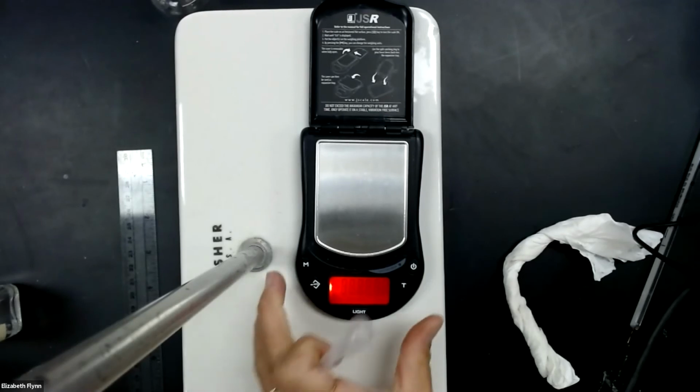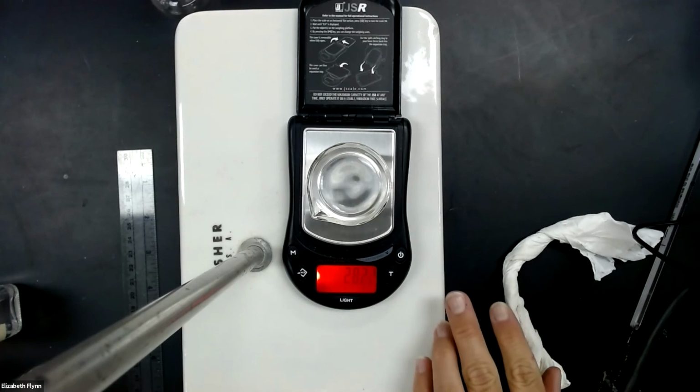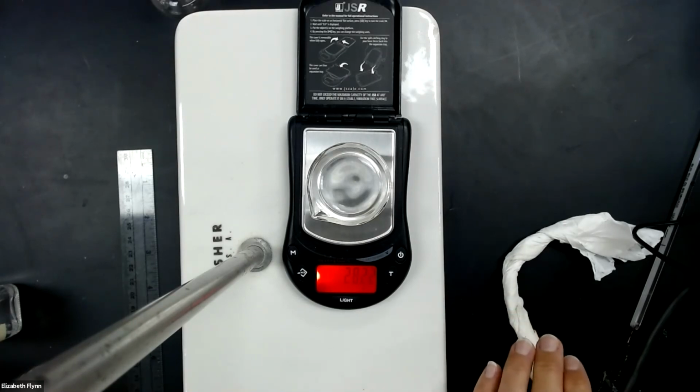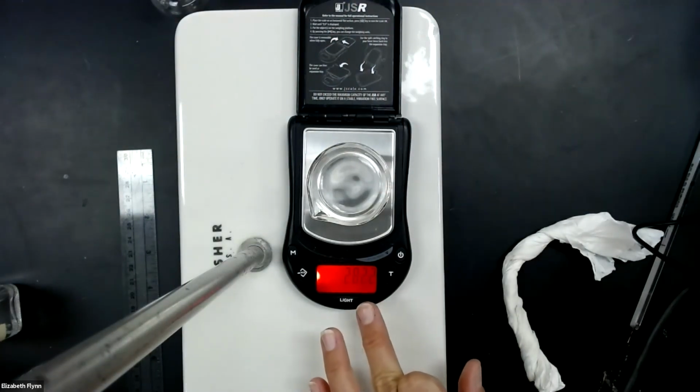All right. So I'm going to turn on my balance again. And now I'm going to add my 30 drops of, as best I can, the same volume to my container. So here I have 28.22.